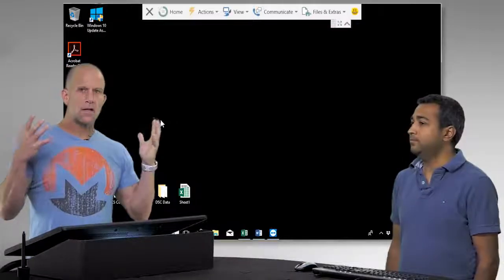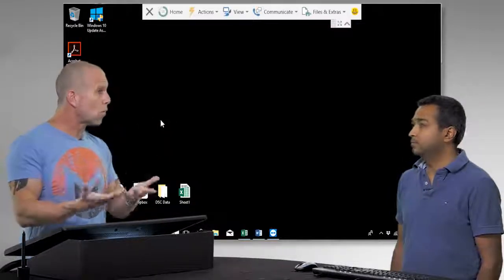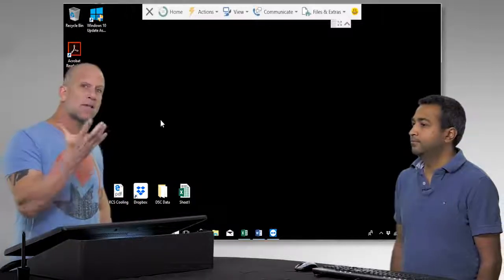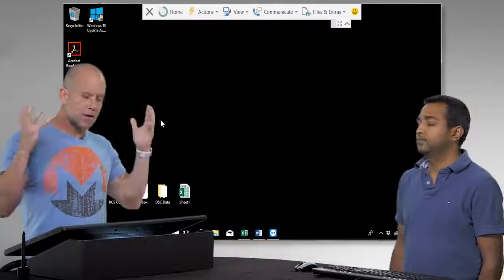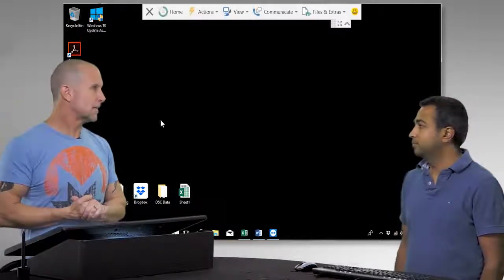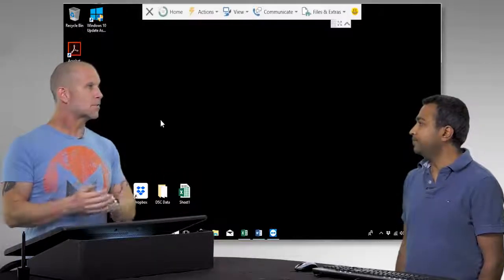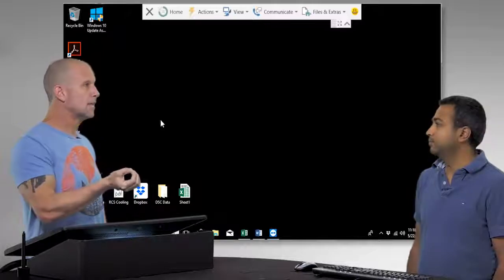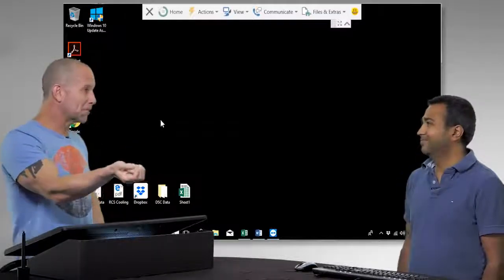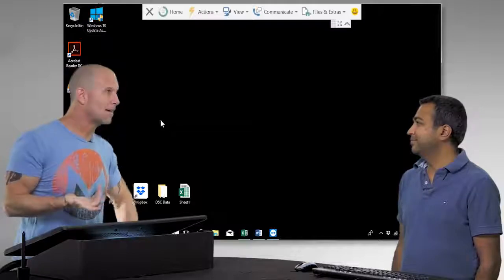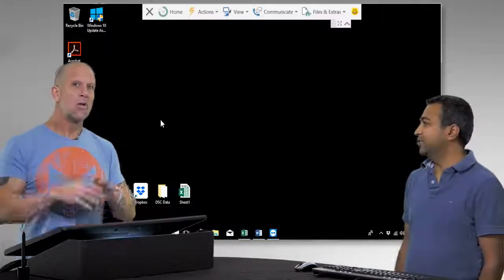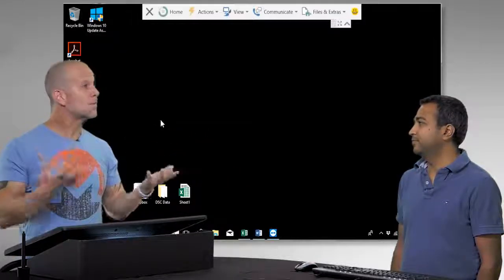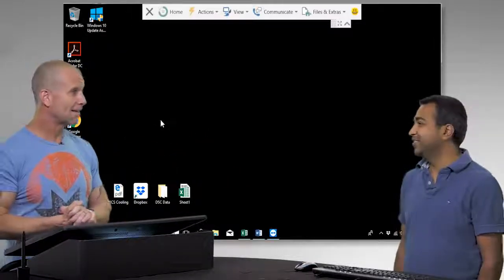If we go to the instrument directly or run it remotely — which is what we're doing — we're pulling back the computer screen to a remote point where you can run it like you're sitting at the instrument directly. In fact, all interactions with the instrument are done through the computer interface. Nothing outside of putting the sample into the auto sampler tray is done directly on the instrument. Whether you sit in front of the computer or run it remotely, you're really doing the same thing. It's very convenient.